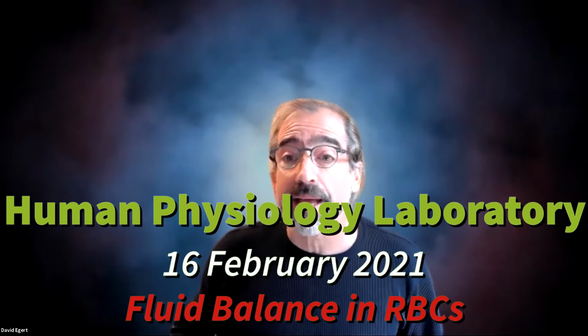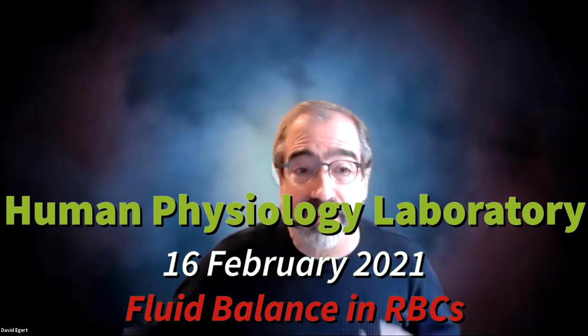Let's talk about this lab today, because I think it's interesting. It takes the theoretical concepts and brings them into a setting that's very clinically relevant. It also makes you think about the concepts in very direct ways, which we are going to continue thinking about for the entire semester: osmosis, osmolarity, and things like that. The more you can get an intuitive feel for it, the better you're going to do.